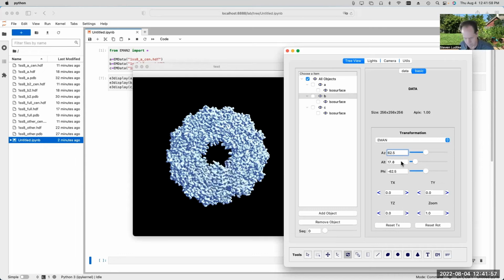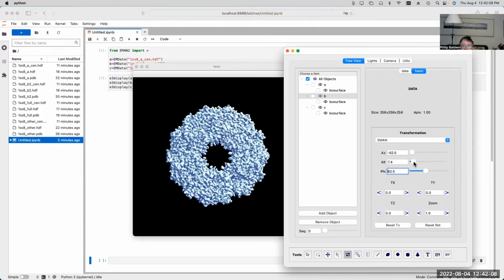Maybe I got... shouldn't the first one be the minus 62.5? Maybe you're right. I think you're right, Phil. I think I got it exactly backwards, because you got the 62.5 to get it to that location, but as comes first. So no, I understand what you're saying. Thank you. Okay, you're correct.